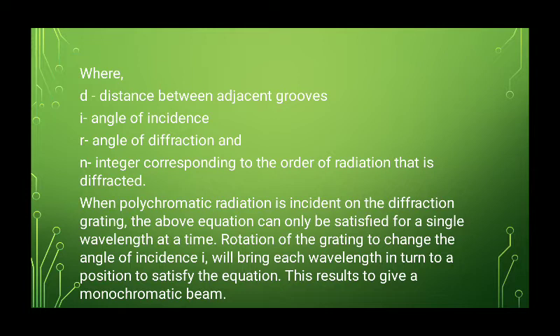When polychromatic radiation is incident on the diffraction grating, the equation n lambda = d (sin i + sin r) is satisfied for a single wavelength at a time.